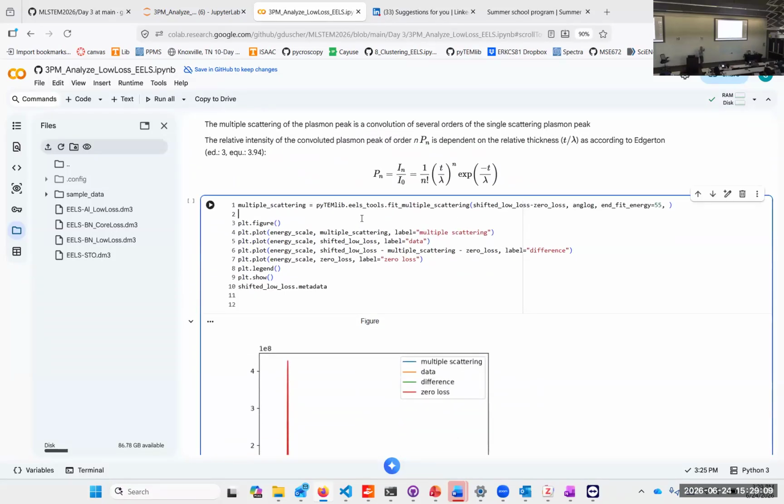Now we go to the multiple scattering. So this little peak that comes there, and that was the first peak around 15, the second one is around 30, and the next one is 45, and so on and so on. Indeed, a single electron can, with a very small probability, excite two plasmons, because it comes in, swings, and does it at some other point as well. So they have a small probability to do two of them with a single electron.